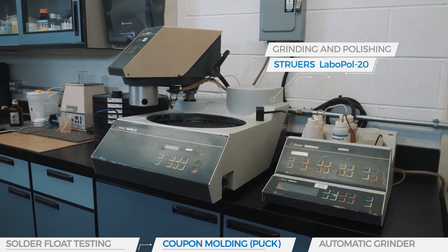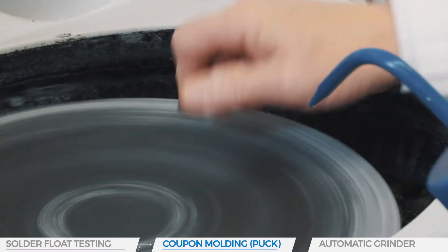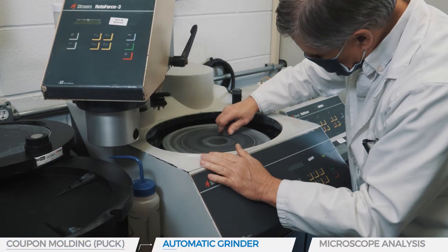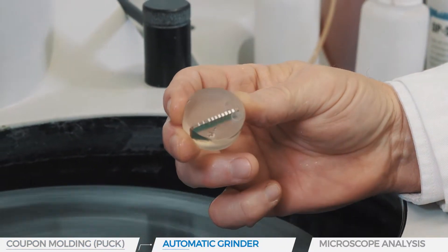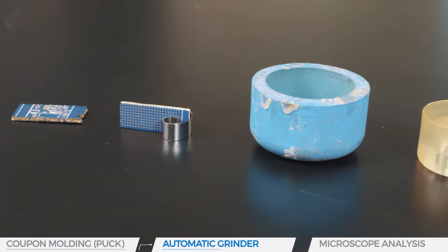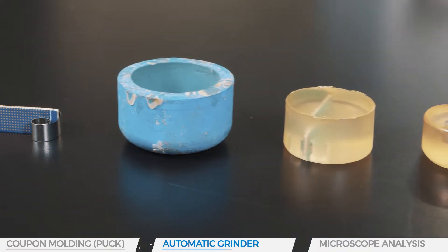Strewers equipment is used to grind and polish the pucks. We start with a coarse sandpaper followed by a finer grit paper, which removes the excess mounting media. The puck is then polished using diamond polishing media, obtaining a very precise surface that can be measured.